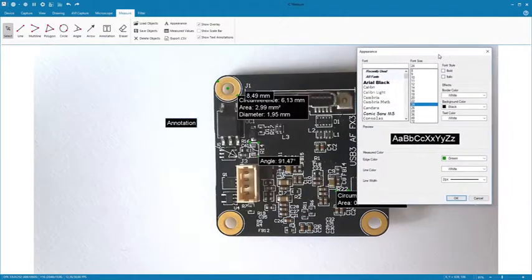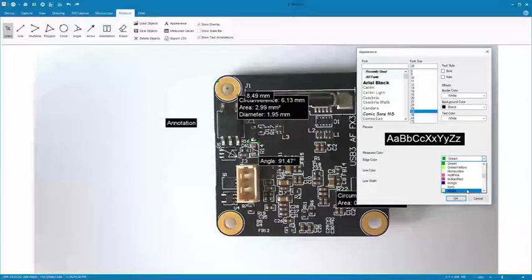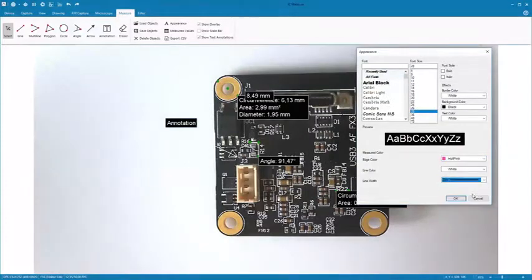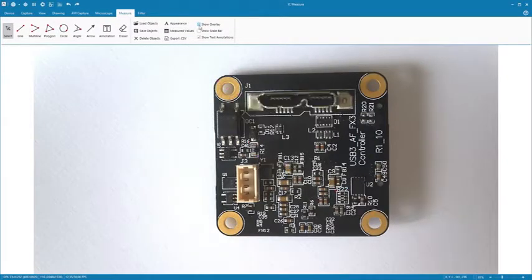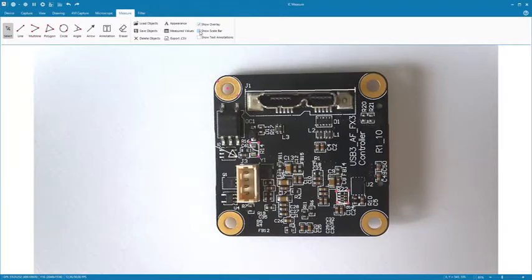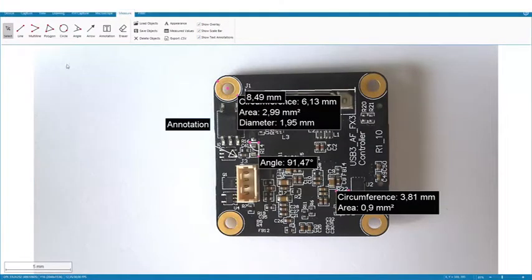In Appearance, you can format the text and the lines of the overlays. All elements are saved as independent layers so that the original image remains intact. Here you can show or hide the various layers.